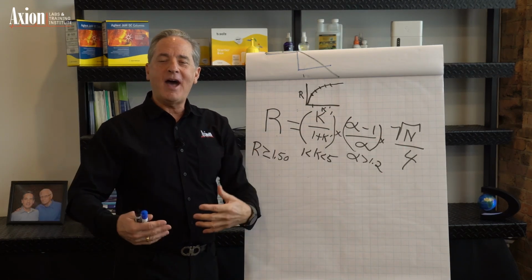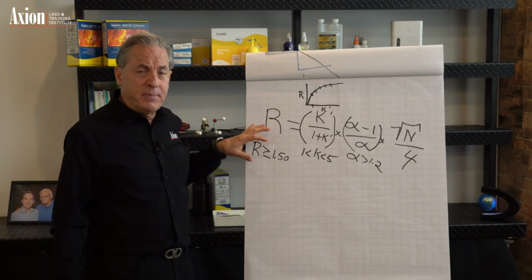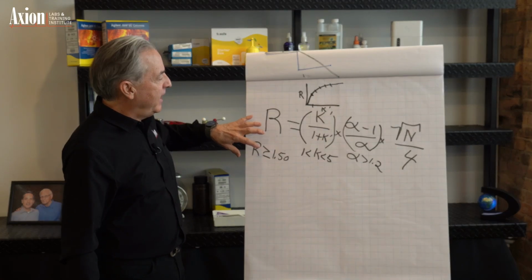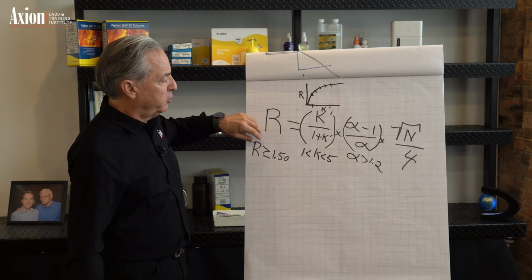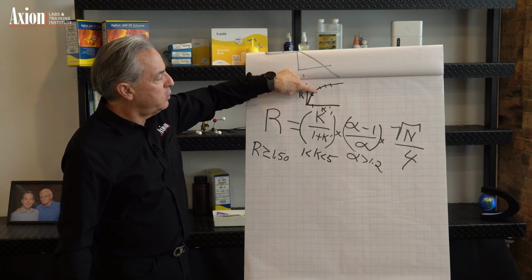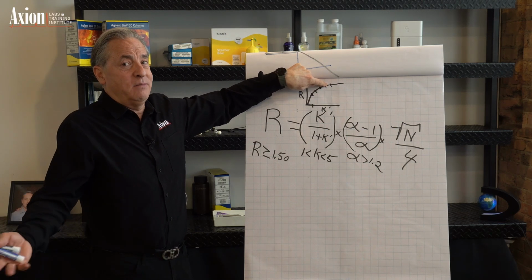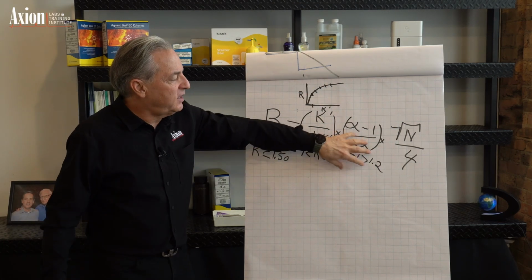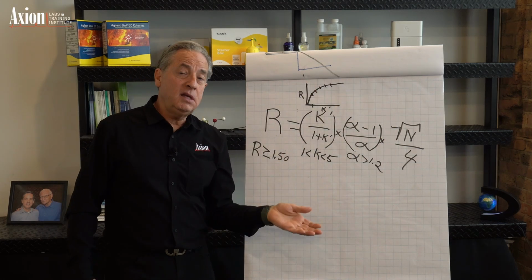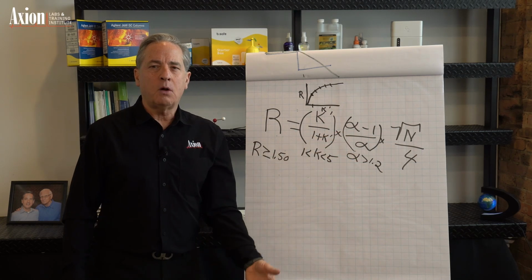So, taking a big step back, where do these numbers come from? The resolution equation is empirical, which is great, which means it actually matches the data, and it gives us the ability to predict this stuff. So capacity factor, simple. You just get it above 1. 2, 3, 4, 5, fantastic. Don't try to get it from 10 to 20 to 30. I can show you how to do it, but no benefit to doing that. And selectivity, this is the chemistry. In LC, this is your stationary phase, C18, cyano, amino, diol, versus the mobile phase, methanol water, acetonitrile water.